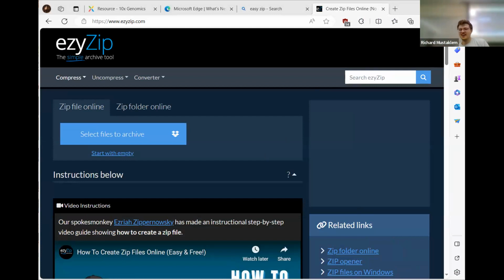Okay, so I'll give it like 2-3 minutes and then we'll continue. But make sure you have a folder, and within this folder, it should have 3 things: barcodes, features, and something else. It should have 3 files within that folder. If you have those, you're good to go.